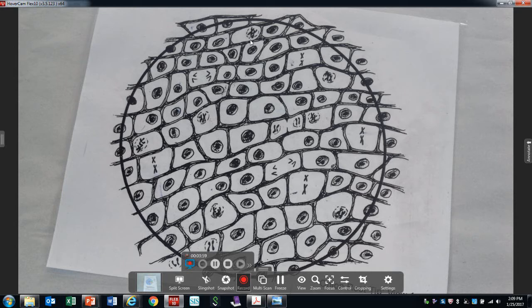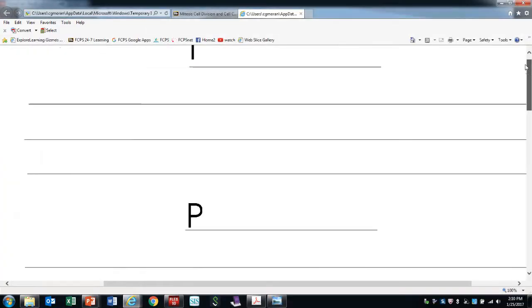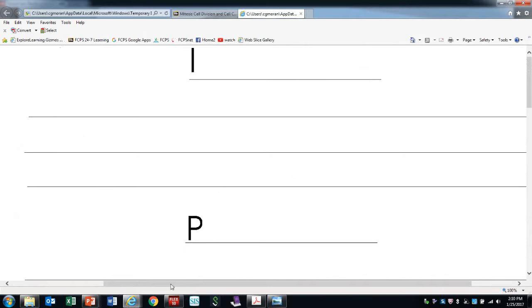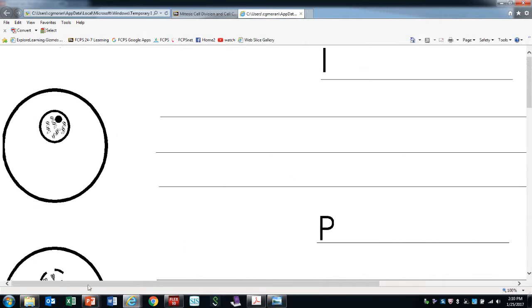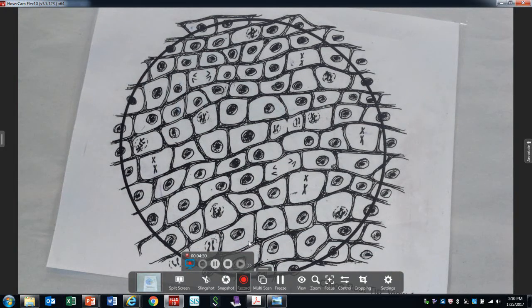You can see chromosomes. Remember our mantra. If you can see chromosomes, it's mitosis. If you can't see chromosomes, it's interphase. Like this picture over here. All right? You can't see chromosomes, so that's chromatin. Versus, you can see chromosomes. They're sister chromatids because they're doubled chromosomes. We called that dyad earlier. And you can see the disappearing nuclear membrane. All right, so something else. What about this?